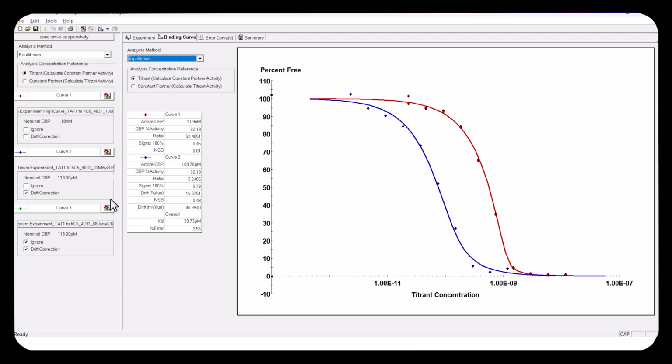And how does it do that? Well, when we come out here and look at it, it has really improved the fit. It really has. I mean, there's still 2 below. These are 2, maybe 3 above, 3 below, but these are a lot closer to the line. And this is the kind of thing that might pass. It's shifted the shape of this line to make it fit the data better.